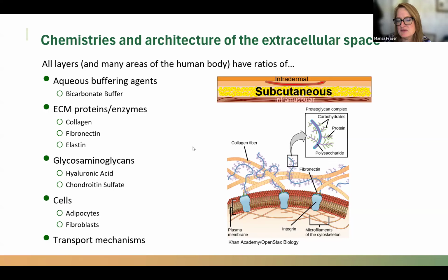Thank you. Another question, Connor: how long does the enzyme stay active under the testing condition? Under the testing conditions within the assay, we have up to a day of release, or at least confirmed stable release for 12 hours. We have validated enzymatic activity within that cartridge up to 20 hours in an assay, and in storage conditions up to 6.